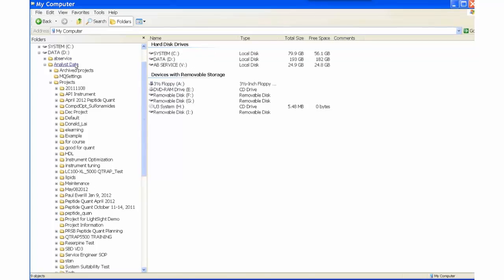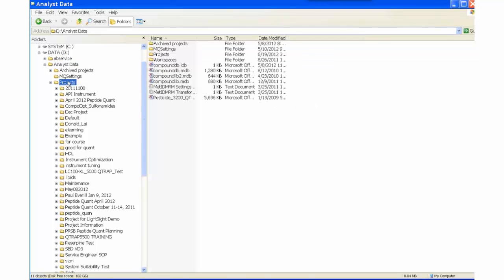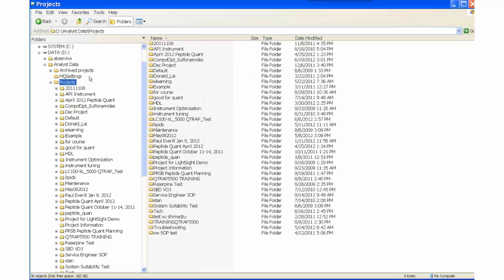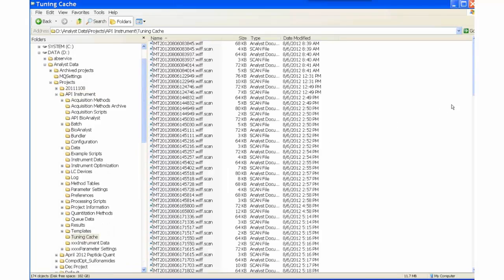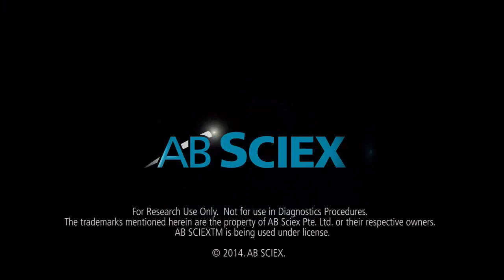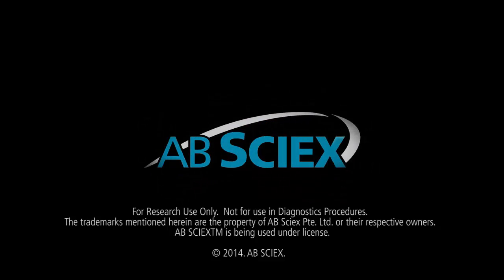Go to the D drive and the Analyst Data folder. Next, open the Projects, and next, open the API Instrument folder. Lastly, the data is stored in the Tuning Cache folder.